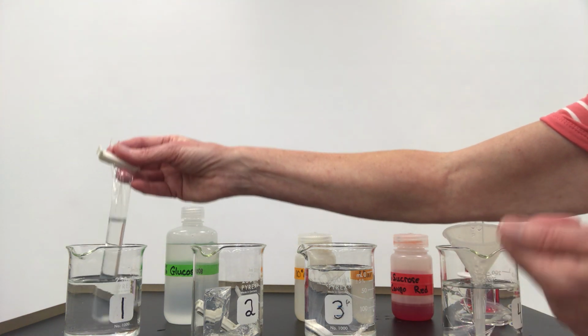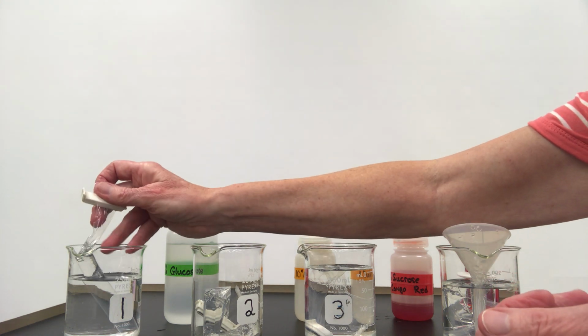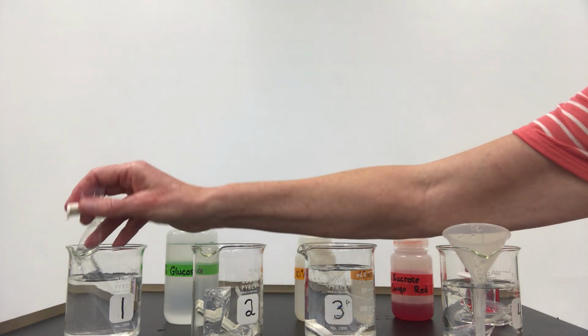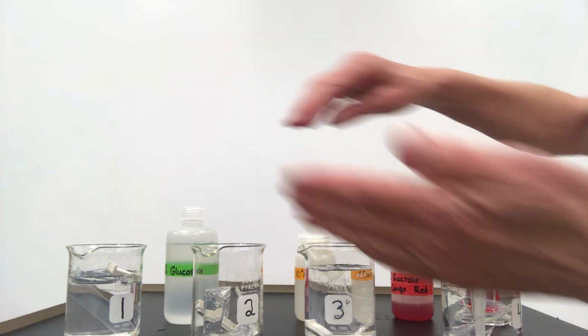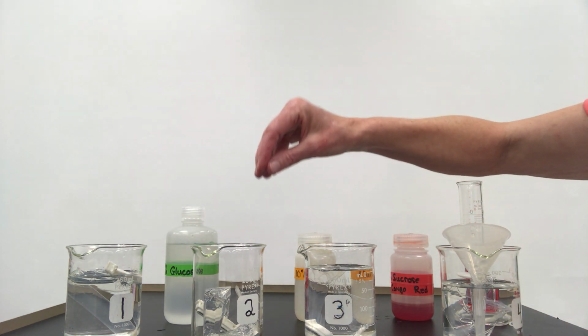Now remember, osmosis is the movement of water into and out of the cell membrane. So this being an example of the cell, the water will either move in or out. And in the hypotonic solution, which means there is more water, less solutes outside the cell than inside, the water should move in. So we should see an increase in weight in that sac.